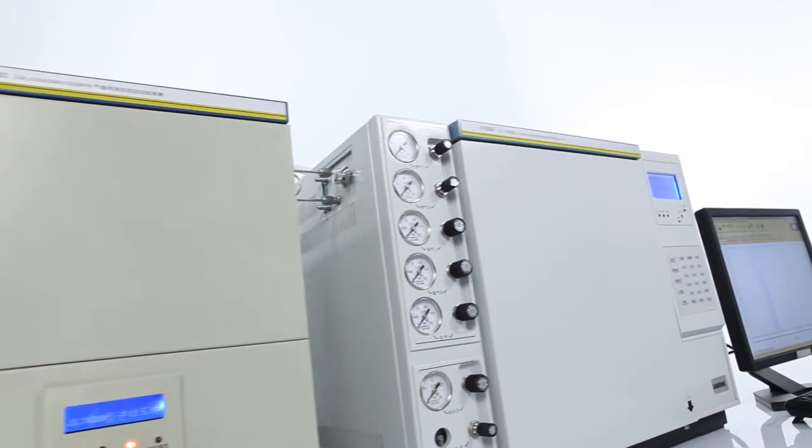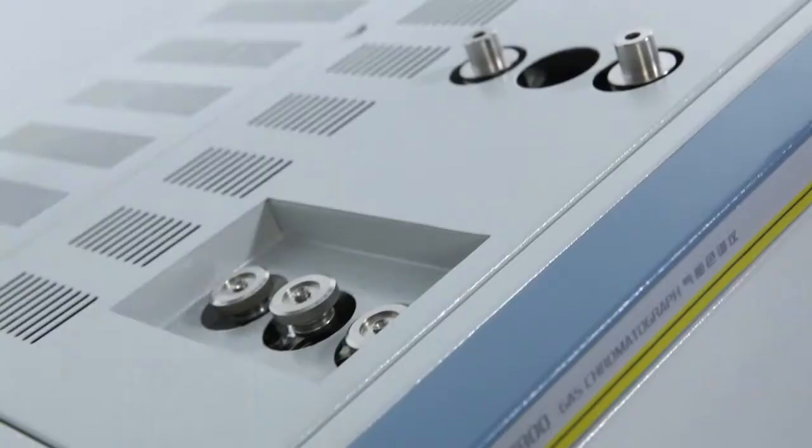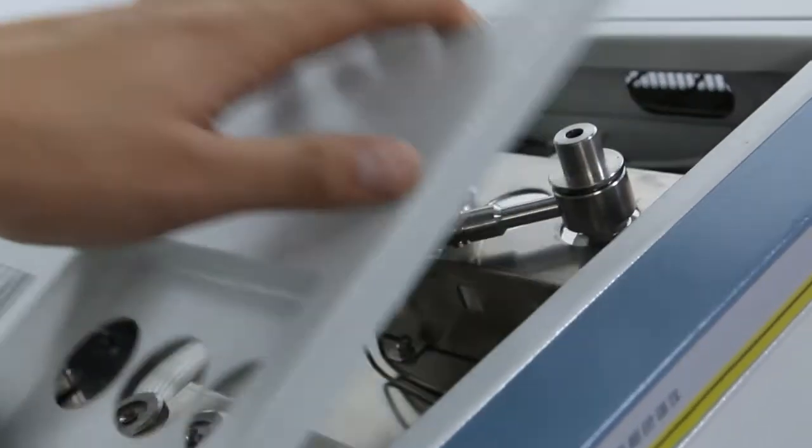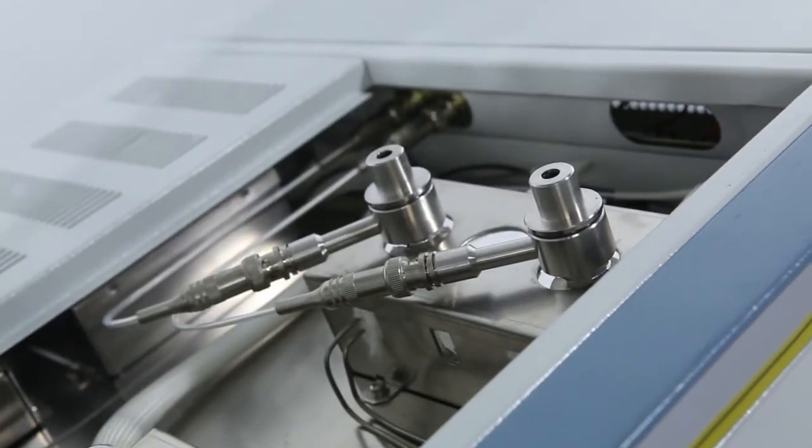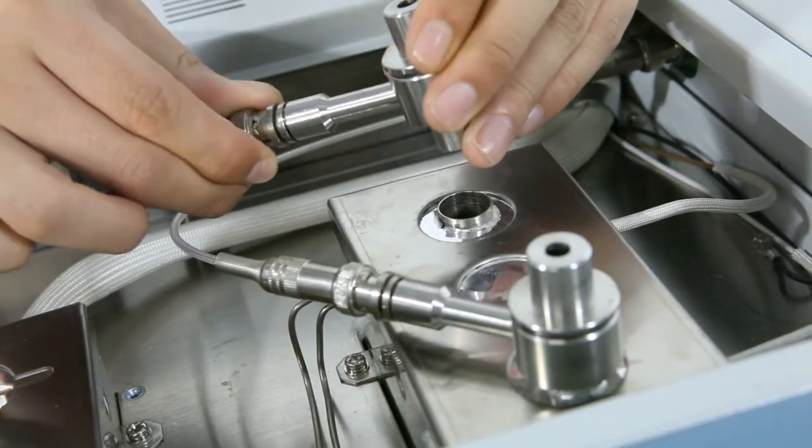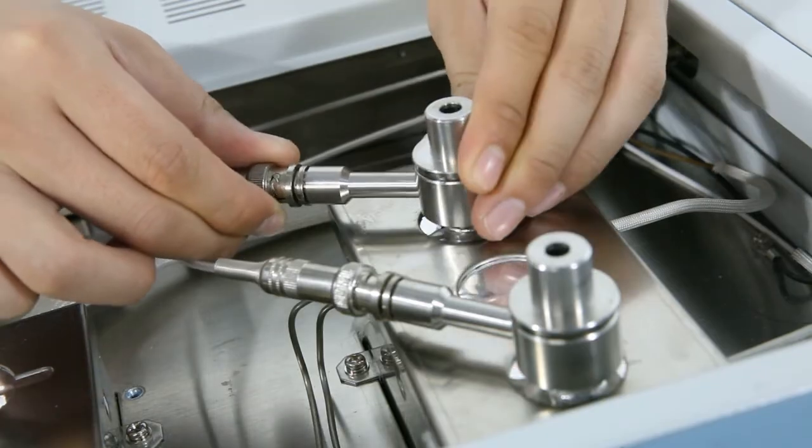The GC7800 gas chromatograph adopts modular design, which means simplified system structure, independent functions, convenient upgradability, and easy maintenance.